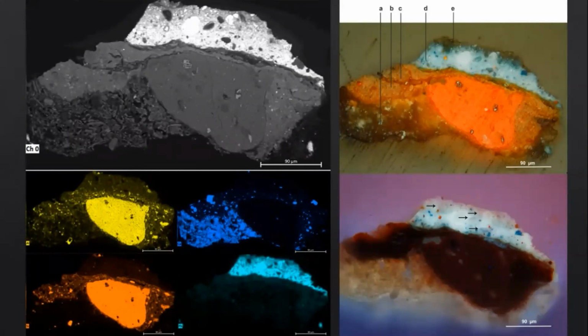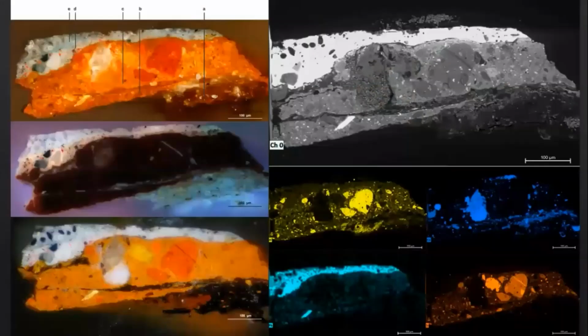Elemental identification of the upper paint layers using SEM-EDX and XRF analysis suggests the pigment palette consisted of lead white, Prussian blue, Naples yellow, yellow ochre, red earths, vermilion, umber, Van Dyke brown, and carbon black. The presence of aluminium and chalk in samples taken from the water and sky were mainly attributed to the use of a mixed substrate for Prussian blue. In many of these samples, round-shaped particles were discovered in backscatter imaging, for which no elemental signal besides carbon was detected.